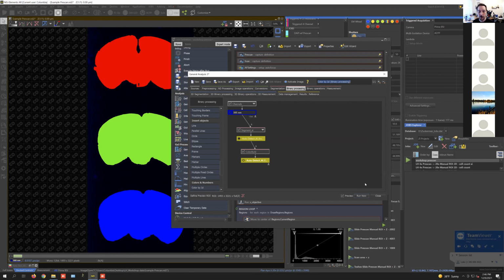And that's basically it. So we can save this as a new general analysis. I can close this.